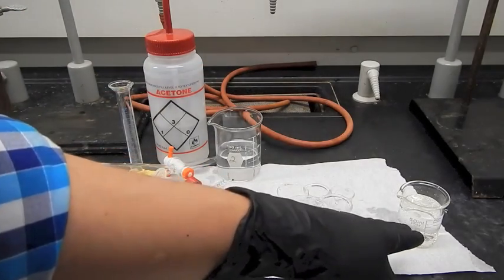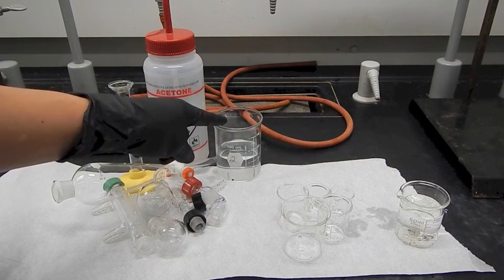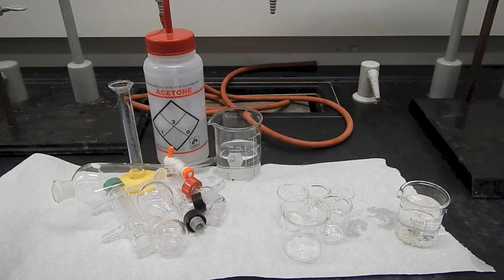So this is going to go in the aqueous waste, and all this organic stuff can go in the halogenated organic waste because we incorporated chlorine into our product.